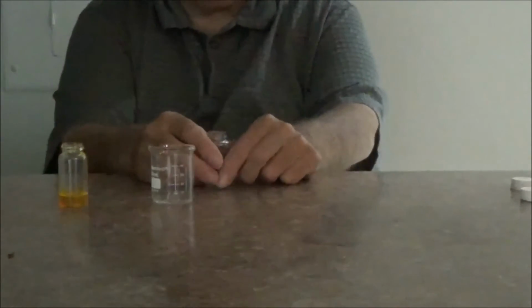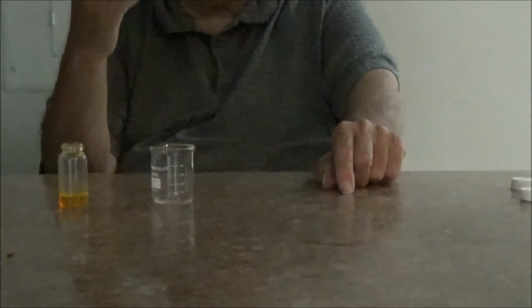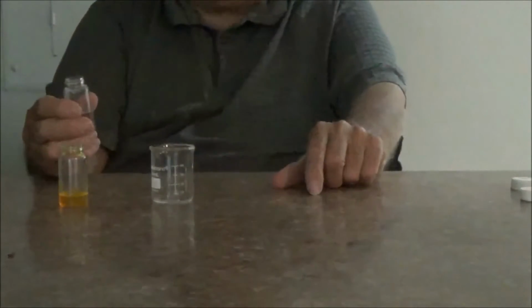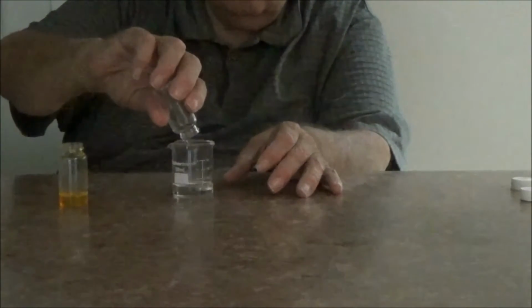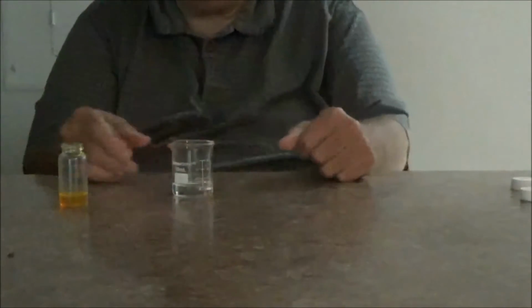So I'm first going to pour that, I guess I'll do it second. I'm going to pour in the first solution, which is the hydrogen peroxide, and we'll pour it in a small 50 milliliter beaker. I'll place it over there.